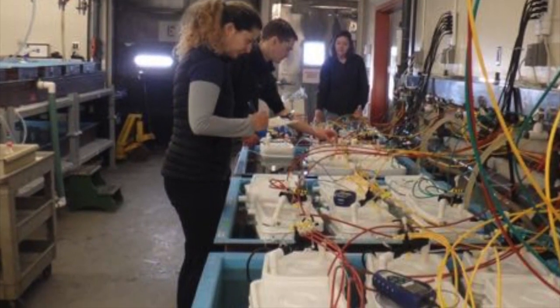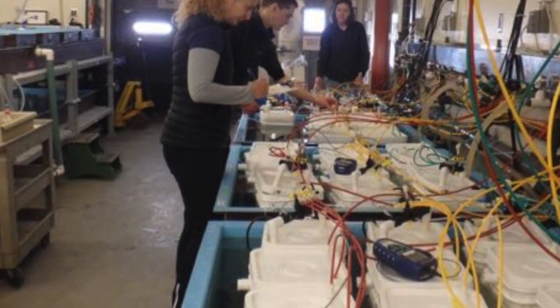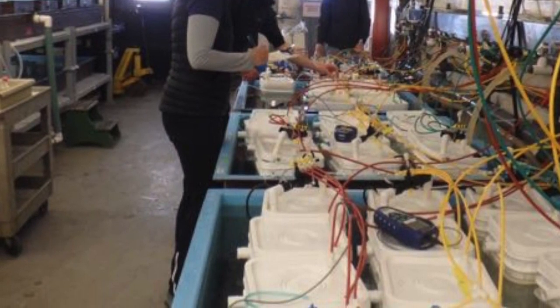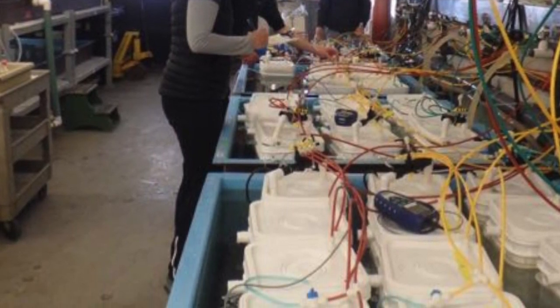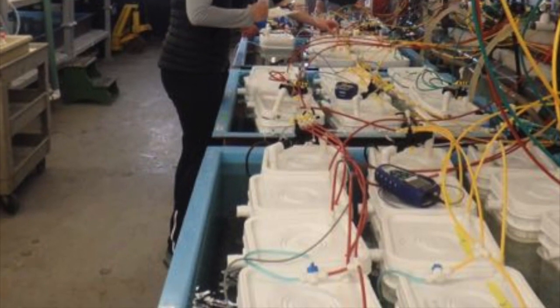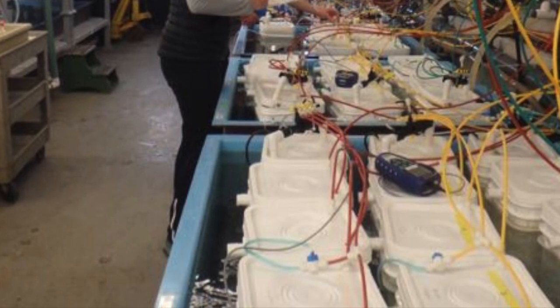The carbon dioxide system is very complicated. First, all carbon dioxide and water vapors are removed from the air. Then, specified volumes of cleaned air and carbon dioxide are remixed in just the correct proportions. It's taken weeks to balance the system and get the tanks just right. Now the tanks are stable and we have the fish. Time to start testing.